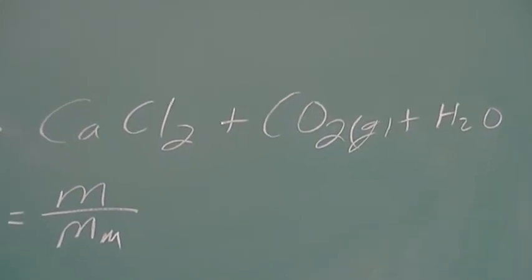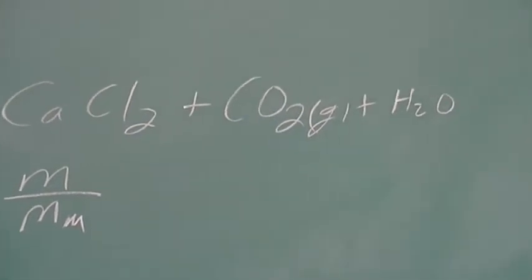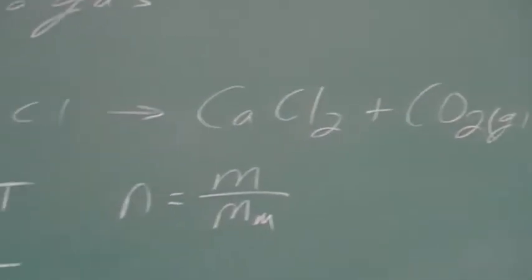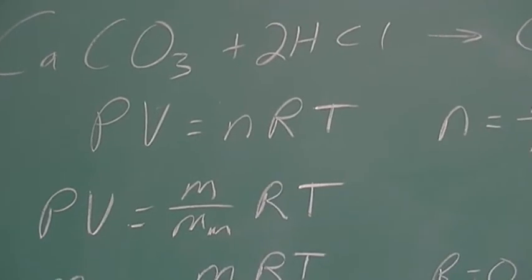Of course, we know the correct answer. We just look at the periodic table and we will have the correct answer for CO2. We are going to do this experiment to see how close we can get to the correct answer. So we're going to be doing the molar mass of a gas.